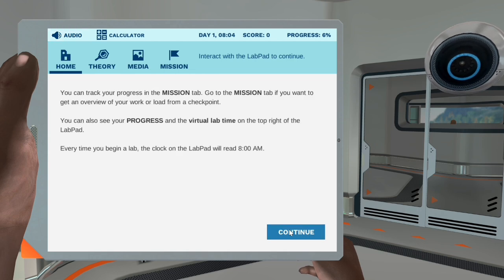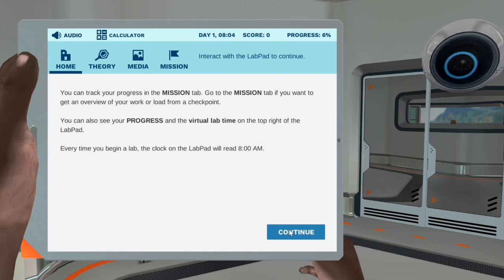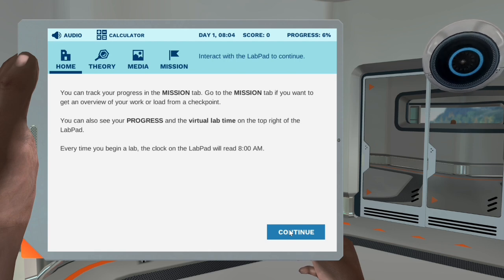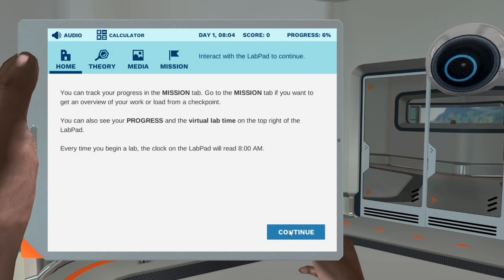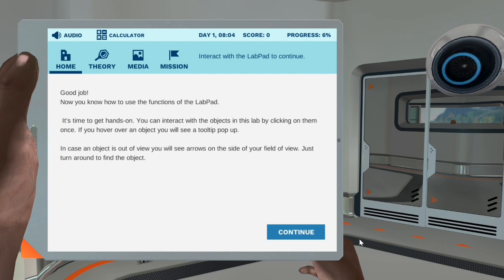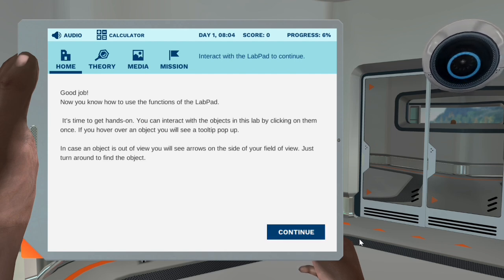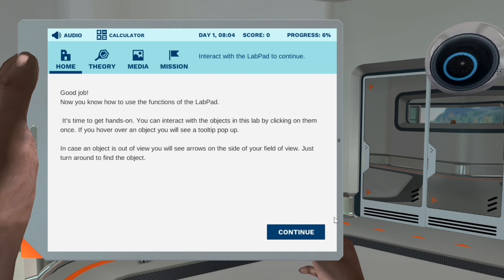The lab pad can also show you images relevant to the simulation. After being shown, they will be unlocked and available in the media tab. Click the view image button to have a look at the hazardous symbols that you may encounter in this lab. You can track your progress in the mission tab. Go to the mission tab if you want to get an overview of your work or load from a checkpoint. You can also see your progress and the virtual lab time on the top right of the lab pad. Every time you begin a lab, the clock on the lab pad will read 8 a.m. Good job! Now you know how to use the functions of the lab pad.